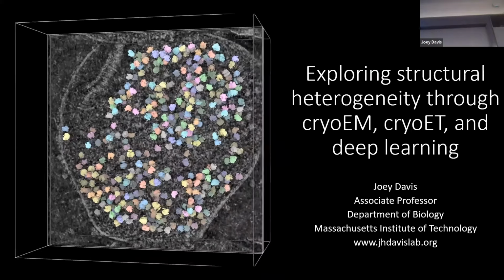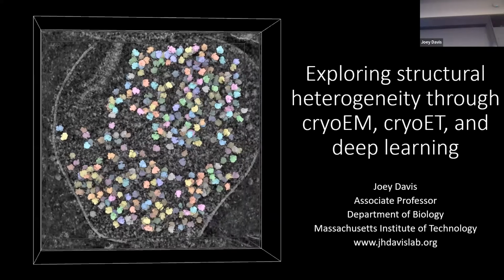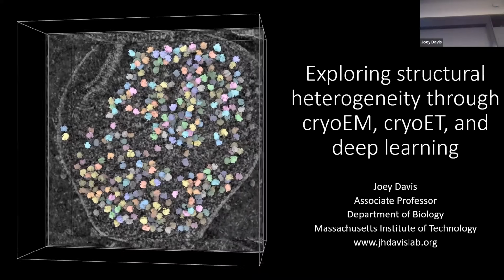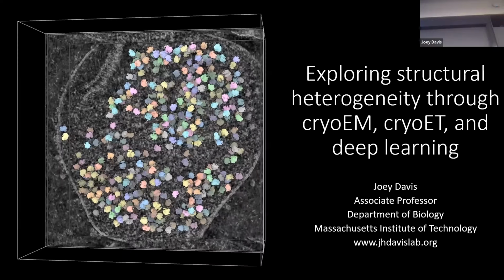This is a bacterial cell, actually called Mycoplasma pneumoniae. And what I've done here is I've highlighted ribosomes within that cell, these distinct structures, and so you can actually place structures of interest into a cellular context.